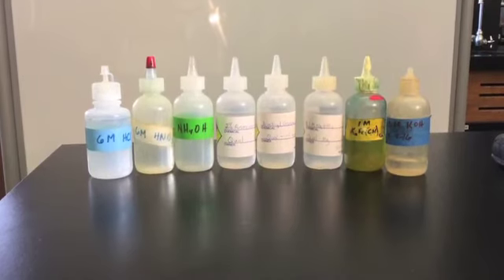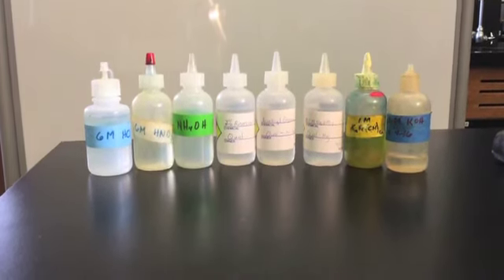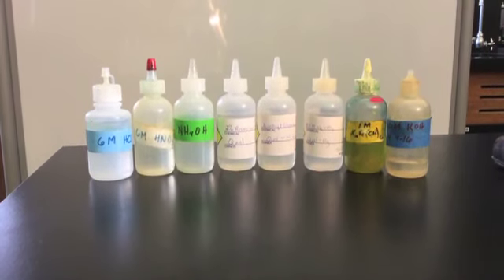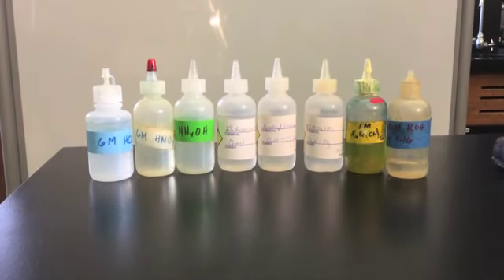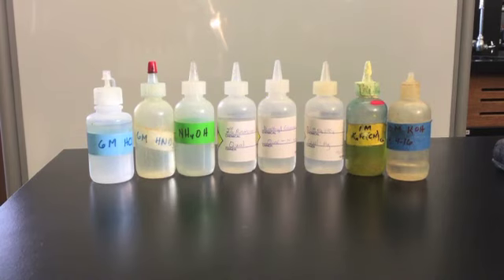These are the reagents we will use to test for the solubility and characteristic reactions of the different ions. Notice that most of them are colorless and all of them are clear. Please take note of the fact that they are colorless to begin with. Our one yellow one will be used in 2 different tests and will have a very different reaction between the 2 of them. Also pay attention as you pick up the bottles to what the concentration is, just in case there is something of a different concentration that is necessary for a different step.